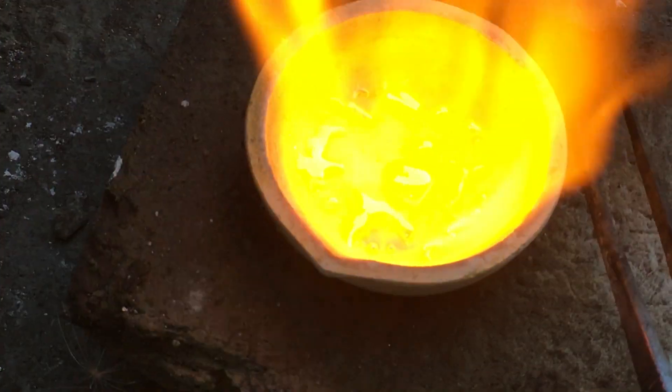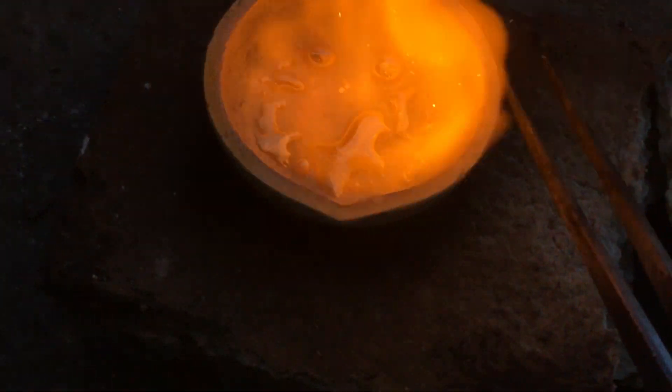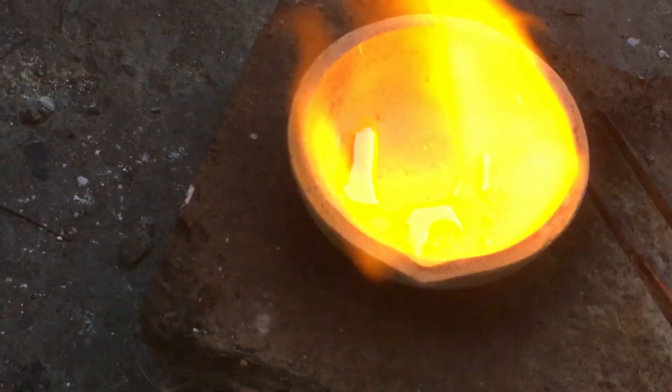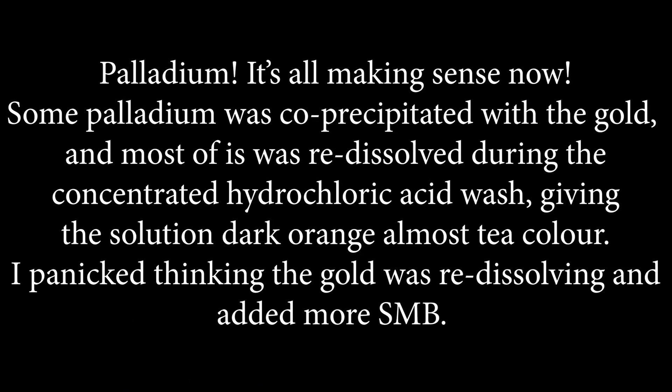Note the sparks. Palladium — it's all making sense now. Some palladium was co-precipitated with the gold, and most of it was redissolved during the concentrated hydrochloric acid wash, giving the solution a dark orange, almost tea color. I panicked thinking the gold was redissolving and added more SMB.